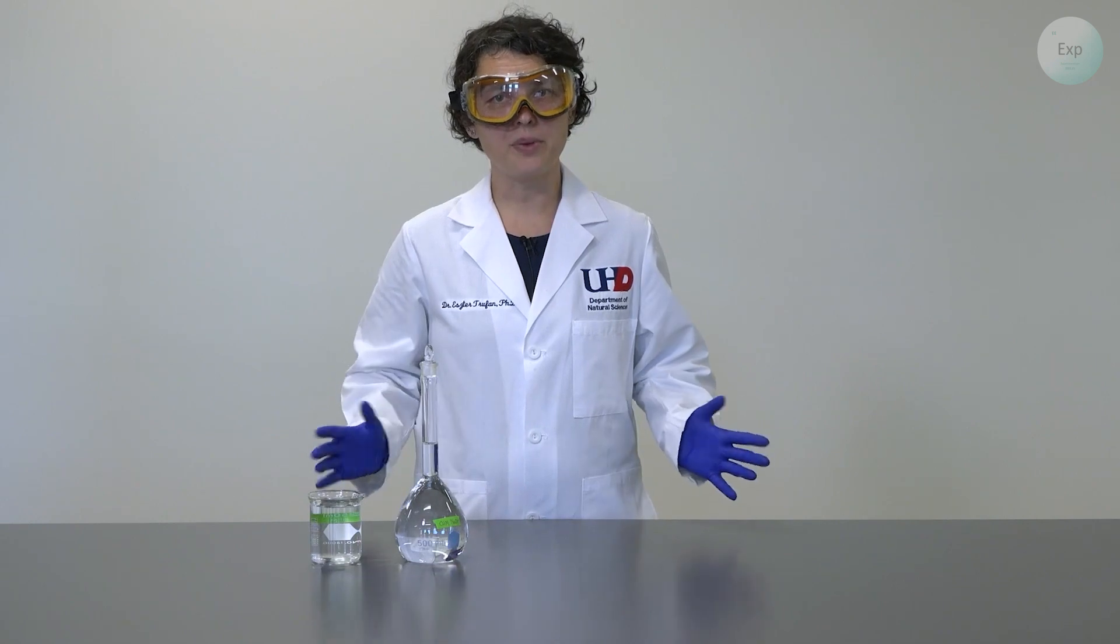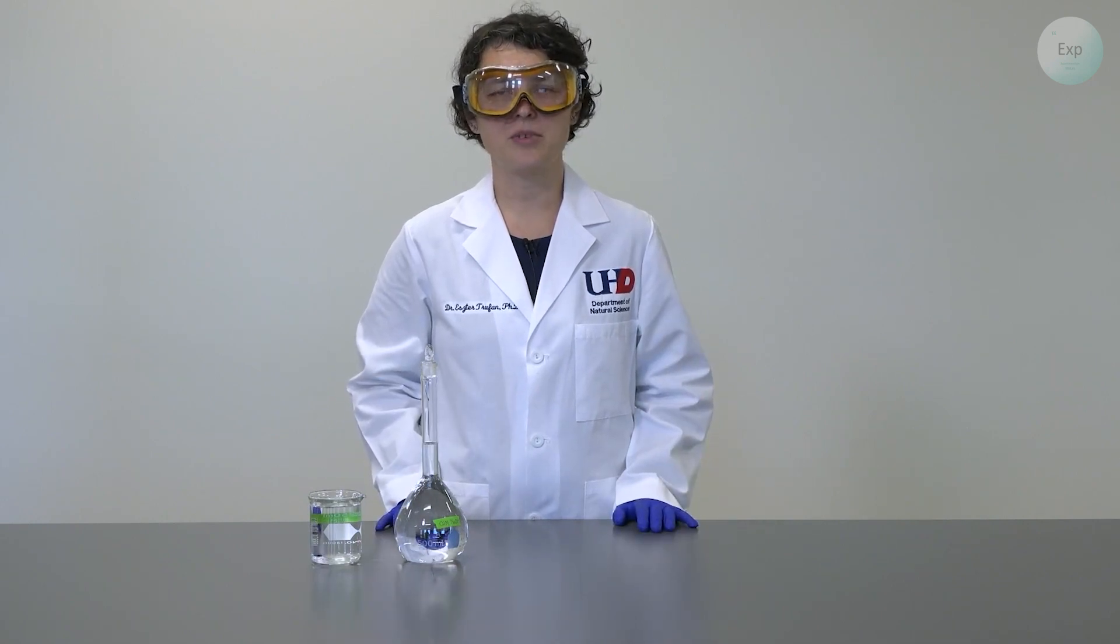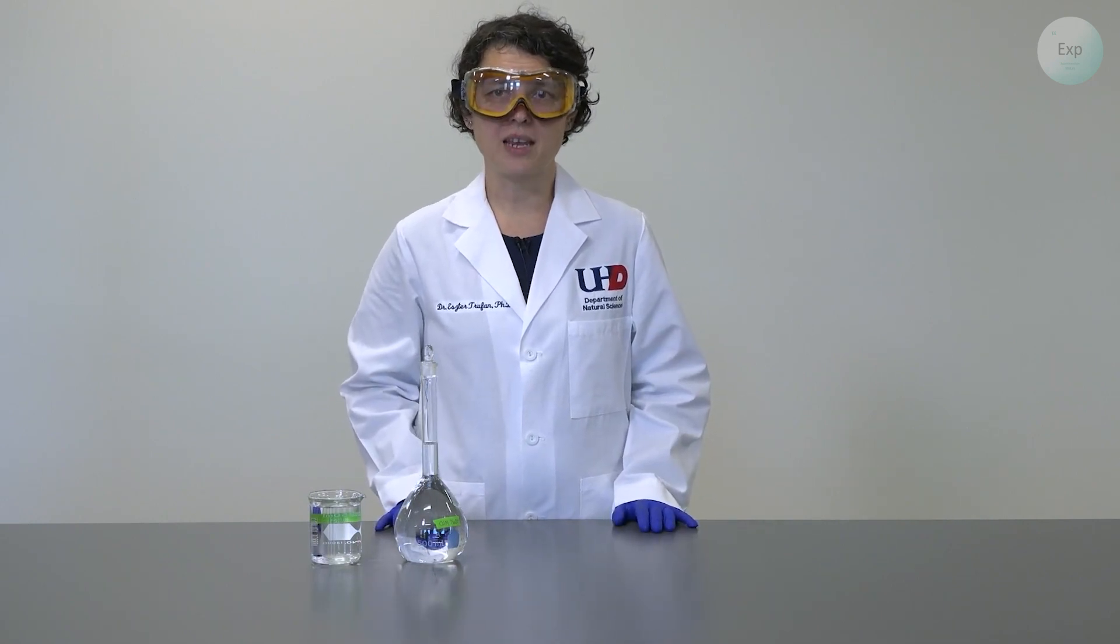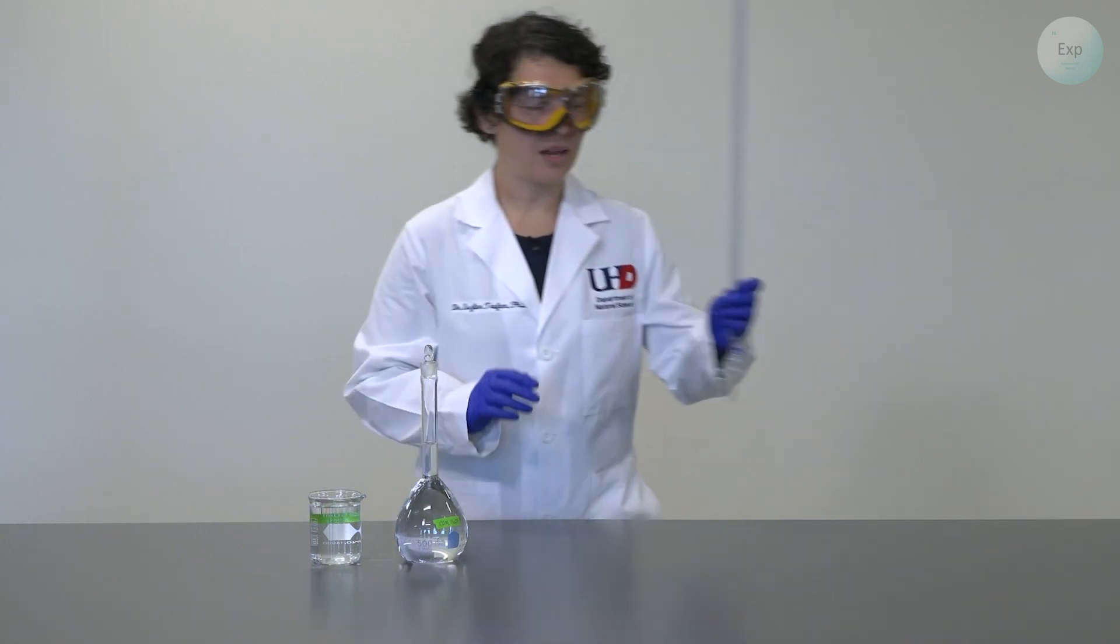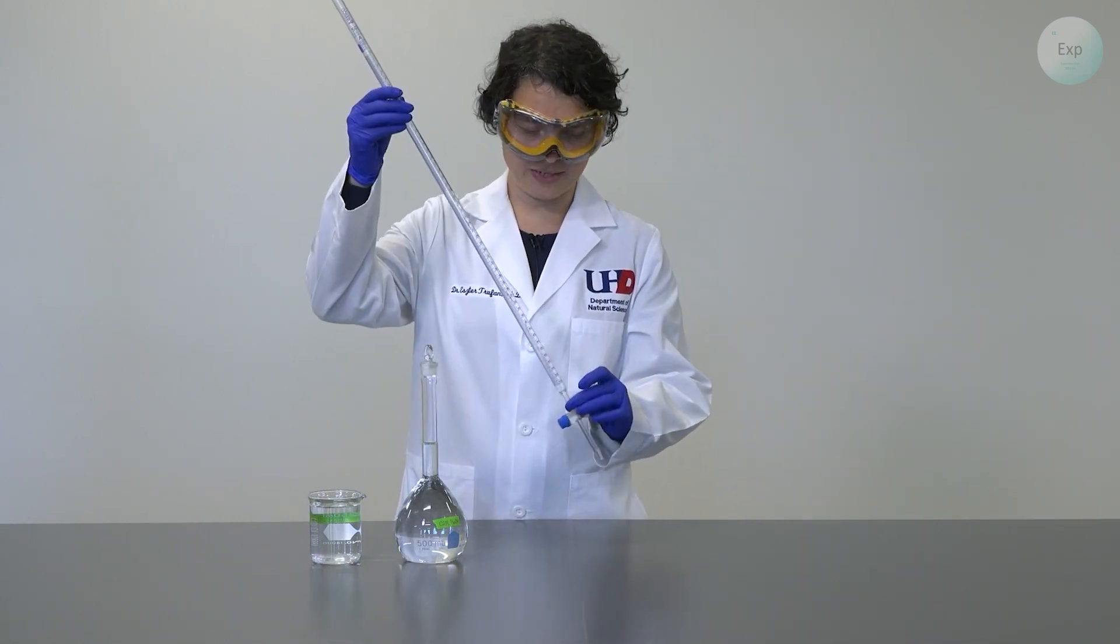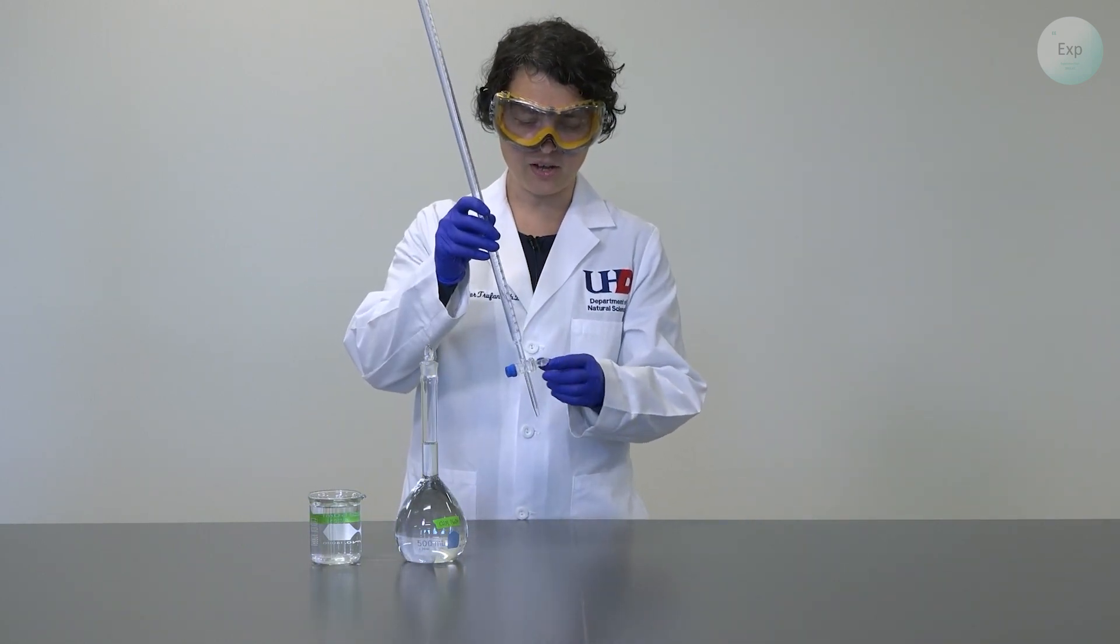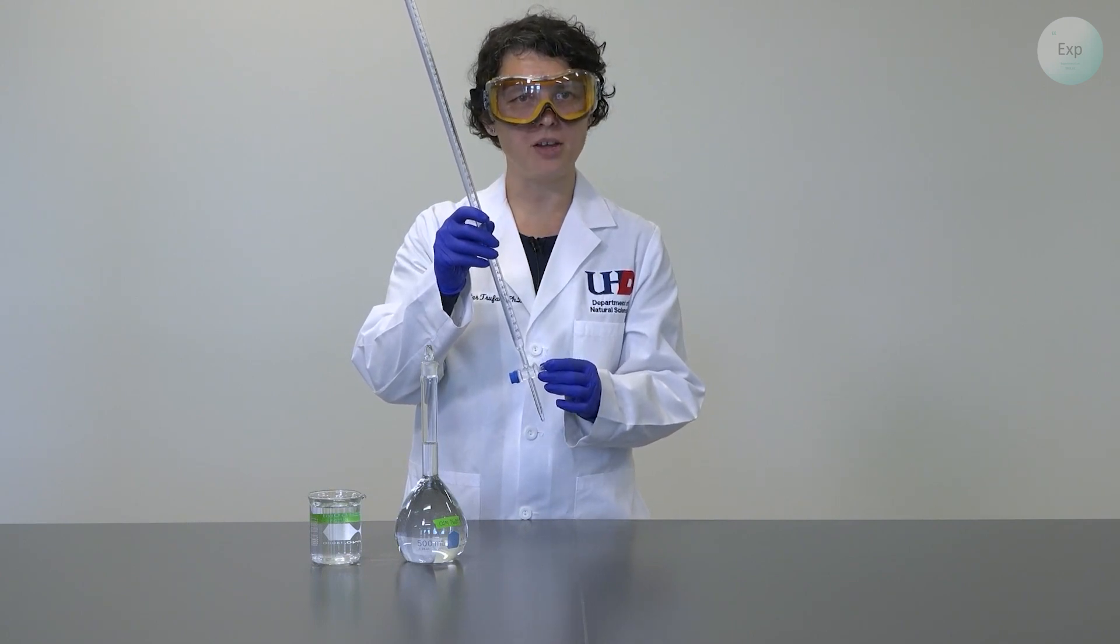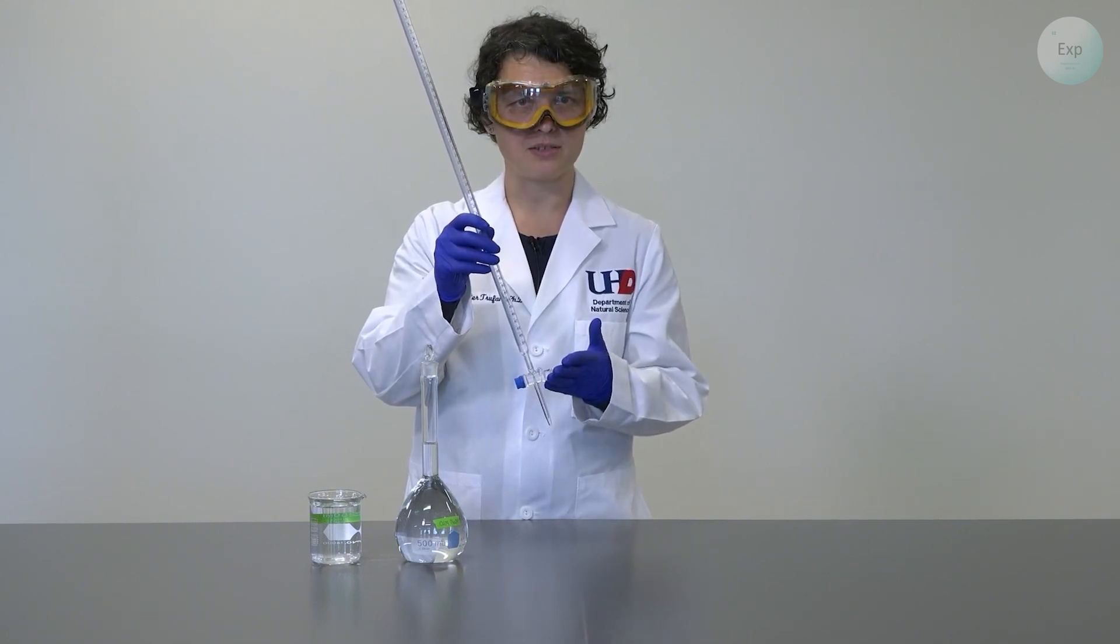As for our equipment, which is the more exciting part of this demonstration, we will need to use a burette. A burette is typically this long piece of glass that has a stopcock on the bottom, which could be made either of glass or teflon. Ours today is made of glass.